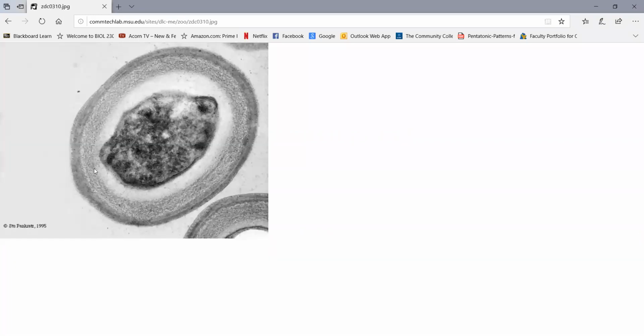So this is just the endospore that was formed inside the bacillus. And the endospore consists of a small mini dehydrated bacterium containing a chromosome and some ribosomes, surrounded by a thick protective coat called a cortex, composed mainly of peptidoglycan, and then a spore coat composed of proteins and sometimes an exosporium. And of course, that endospore can survive under harsh environments pretty much indefinitely until there's a suitable environment, in which case the endospore germinates and a single vegetative bacterium emerges.